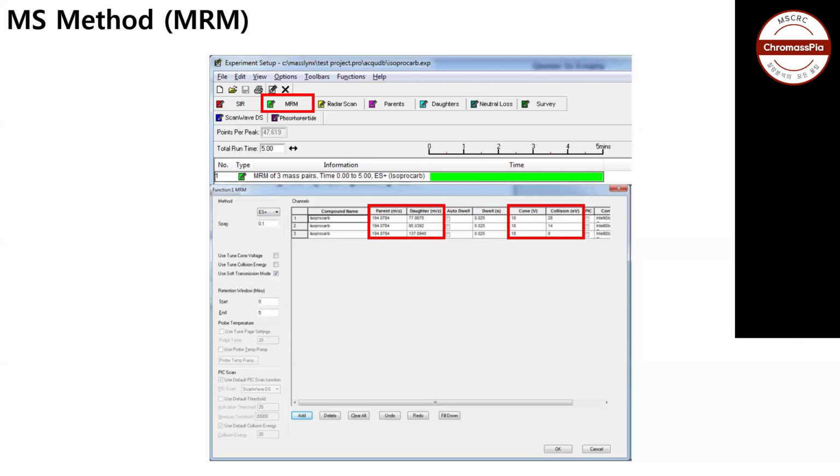Any other questions? Yes, Samjun, I have a question about the dwell time. You have not used auto dwell; you used 0.025 dwell time. Is there any reason, or when we are doing optimization, do we need to optimize the dwell time? In this picture, it is not my project. I just got the image from that. But I just use AutoDwell.